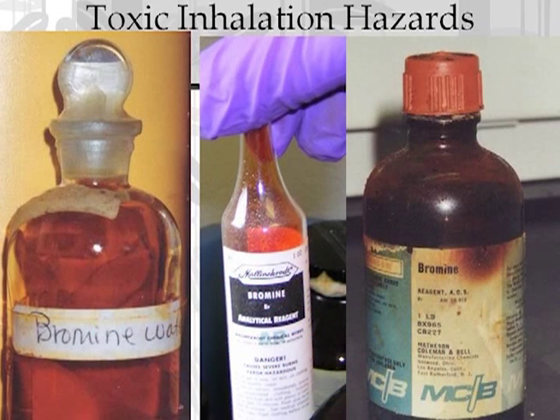Let's talk about toxic inhalation hazards. These are actually materials that we find fairly regularly in schools still. And these are compounds where if the container is broken or is opened, they're either liquids or gases at room temperature and are going to start spreading through the room. And breathing them in can create an inhalation hazard to you. One of the most common ones we find is bromine. Bromine liquid, bromine solutions. And when you breathe in bromine vapors, it forms hydrobromic acid in your lungs.